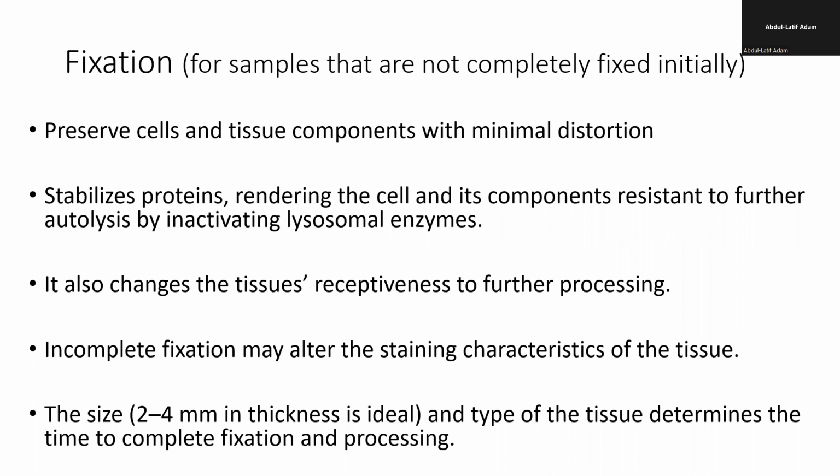Just like meat or fish. If you buy meat that has been on the bench for a very long time, or with the abattoir or with the butchers for a very long time, you realize that it doesn't taste like getting it fresh and cooking it, okay? Because when you leave it, it will undergo autolysis and putrefaction. It will lose its taste. So the same thing, you fix the tissue to preserve it so that it can be in its natural state, so that when there is an abnormality with it, you'll be able to identify it, but it will not be as a result of the enzyme digestion or the bacteria digestion, okay?